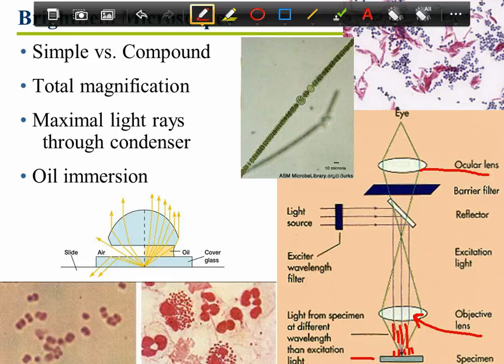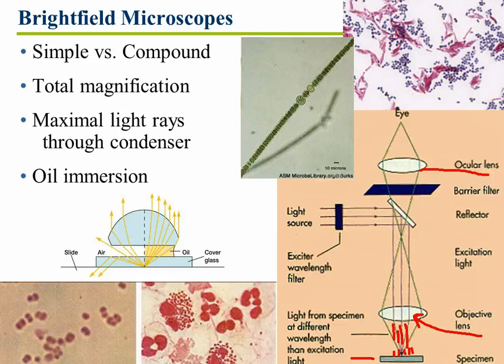That's what bright field microscopy is. This max light, although you can control it with your diaphragm to reduce it, gives you a white background with your object being darker against the white background. The one I've just highlighted is an algal organism, and it's got chlorophyll. It's green without a stain, but you see a stained specimen of bacteria right over there. And again, a reference to the importance of oil. And here's some stained bacteria. So that's bright field microscopy. That's the one you're familiar with.